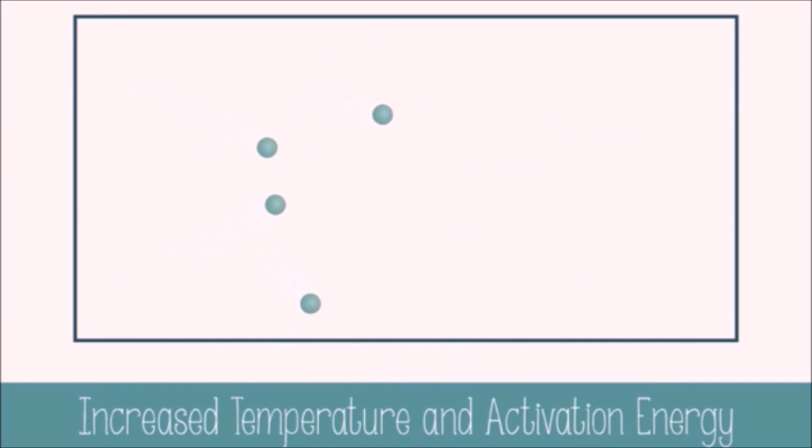Generally speaking, most reactions will occur faster when the temperature is increased, because temperature is the average kinetic energy of the particles. With more kinetic energy, they will be more likely to have enough activation energy for the reaction to occur. In this experiment, the objectives are the following.